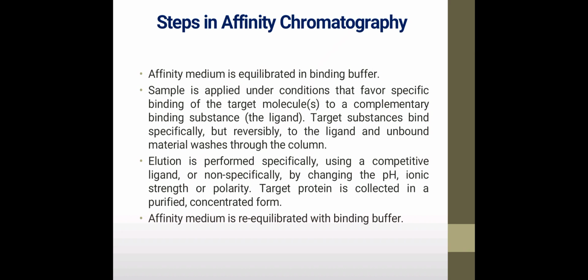So this is one of the best examples of how a molecule can be separated using affinity chromatography. The affinity medium will then be re-equilibrated with the binding buffer.